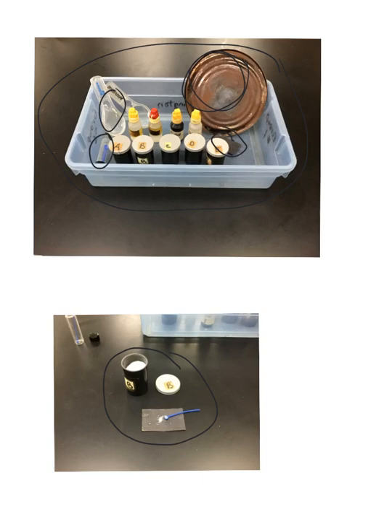And you can use the magnifying glass, but take down what is its texture, what is its color, what is its shape. Is it crystalline? Is it powdery? Does it have any other type of characteristics that make it unique? And particle size. All these things you can put down. Just don't put in your data table white powder. Okay, you need to be more explicit than that, because the more specific you are in each of them, the easier it will be to figure out which of them is which. Okay, so that'll be the first part of your data table.